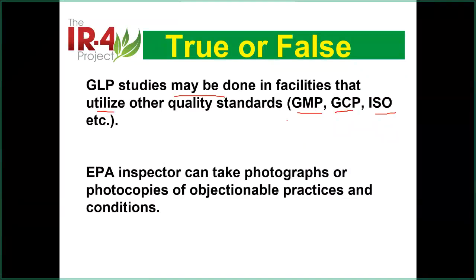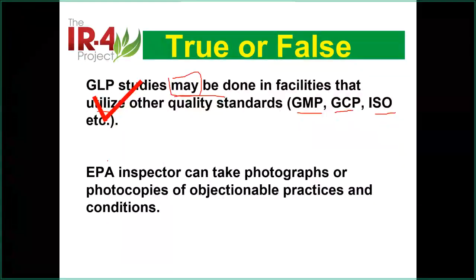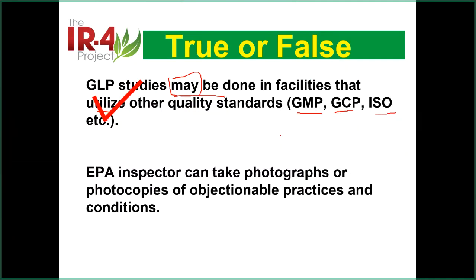If this is false, that means you must be certified to do the GLP work. Okay? The correct answer should be that this is true. You may do it, but you have to follow all the requirements. You do not have to certify your lab, or the lab must be only doing GLP.